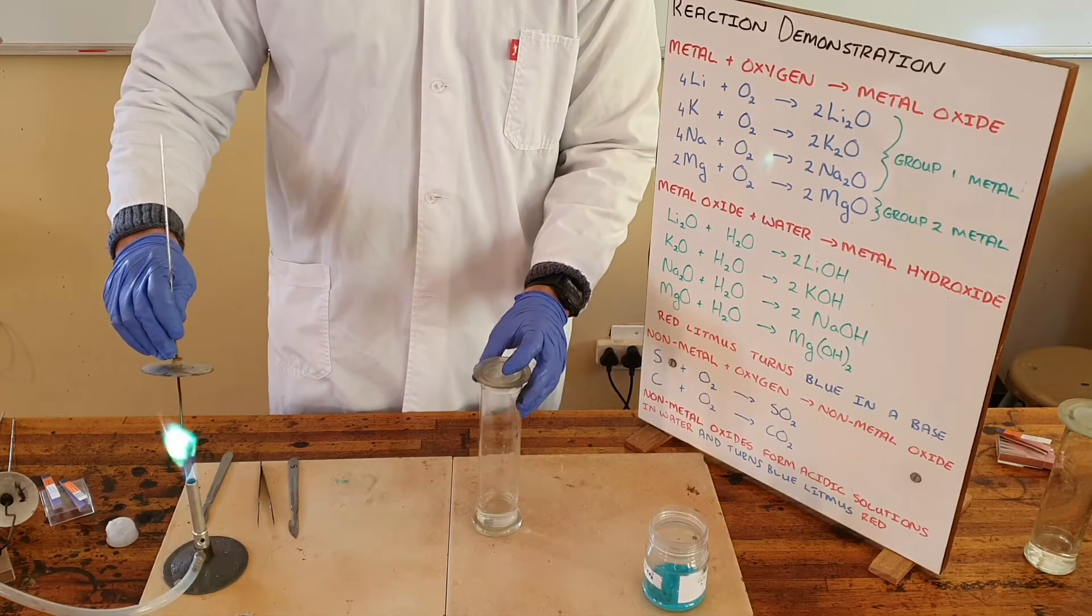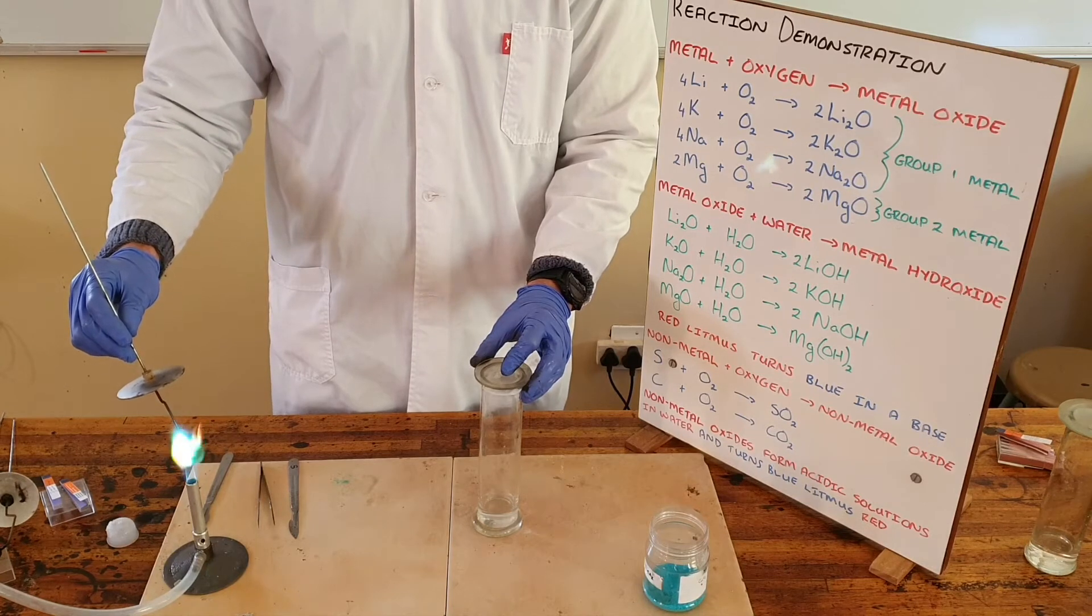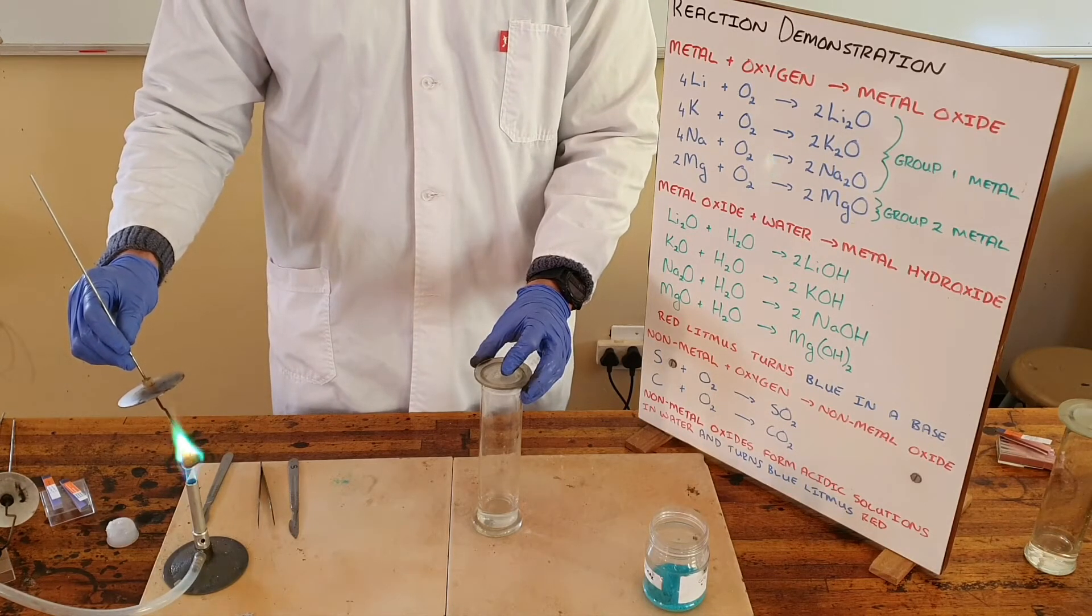So we're going to burn this and ignite it, and once it is burning place it in the gas jar which contains pure oxygen.